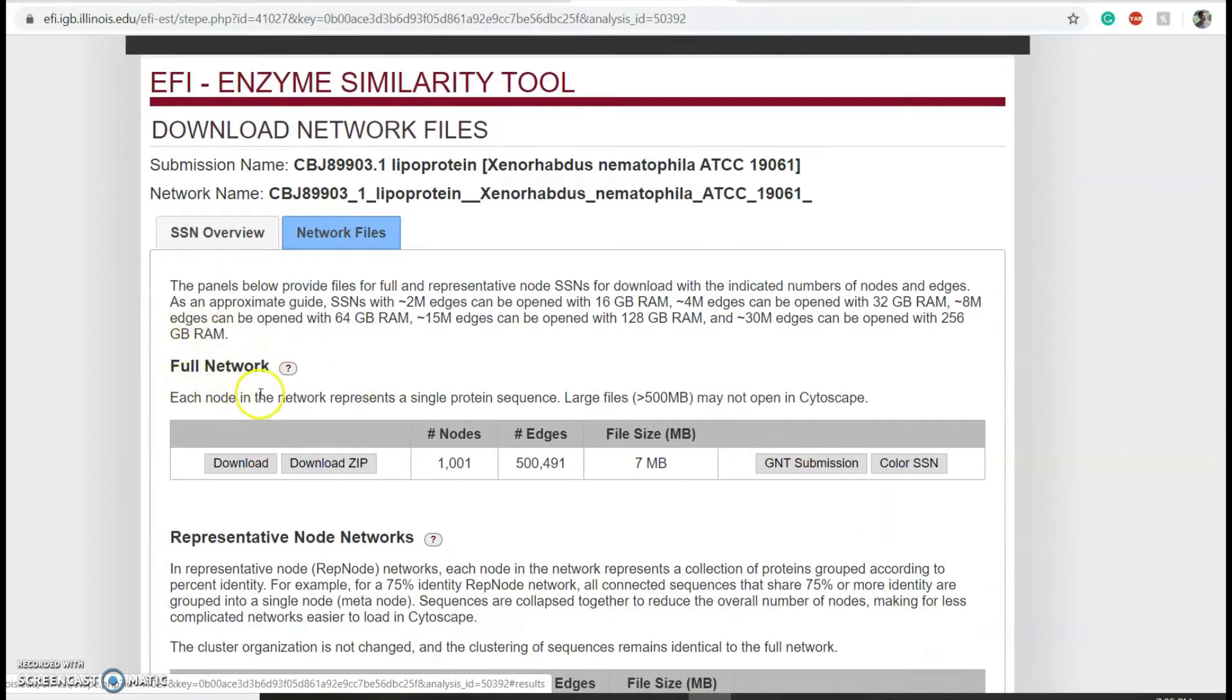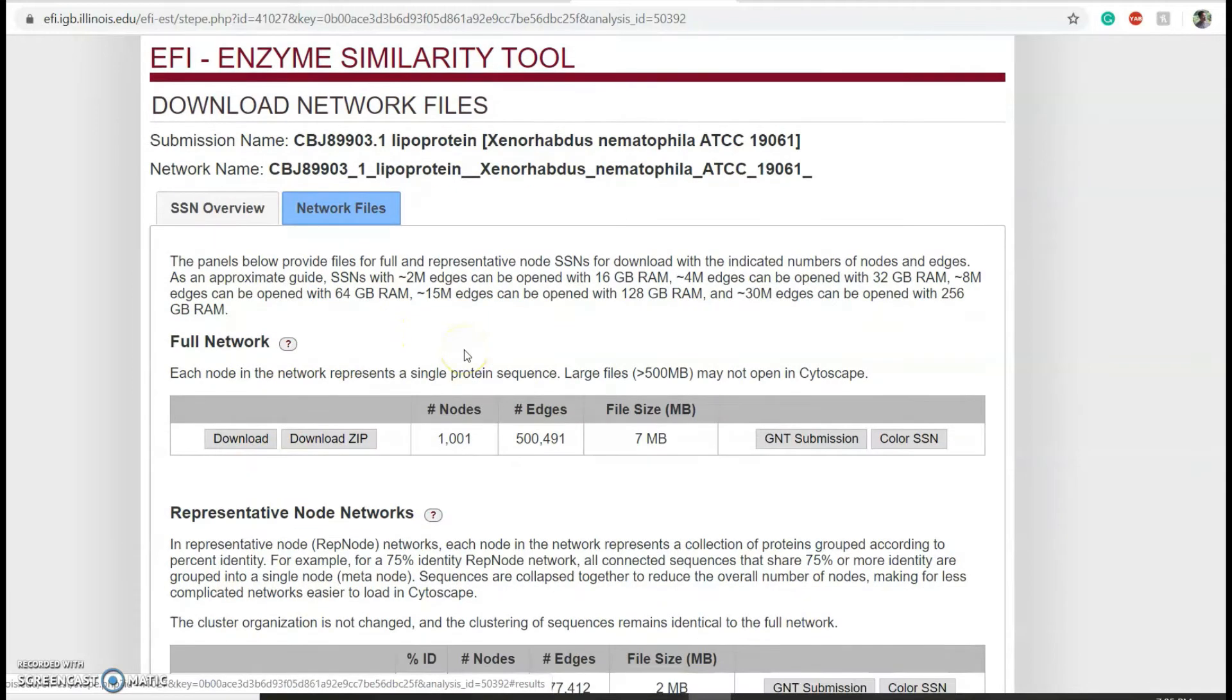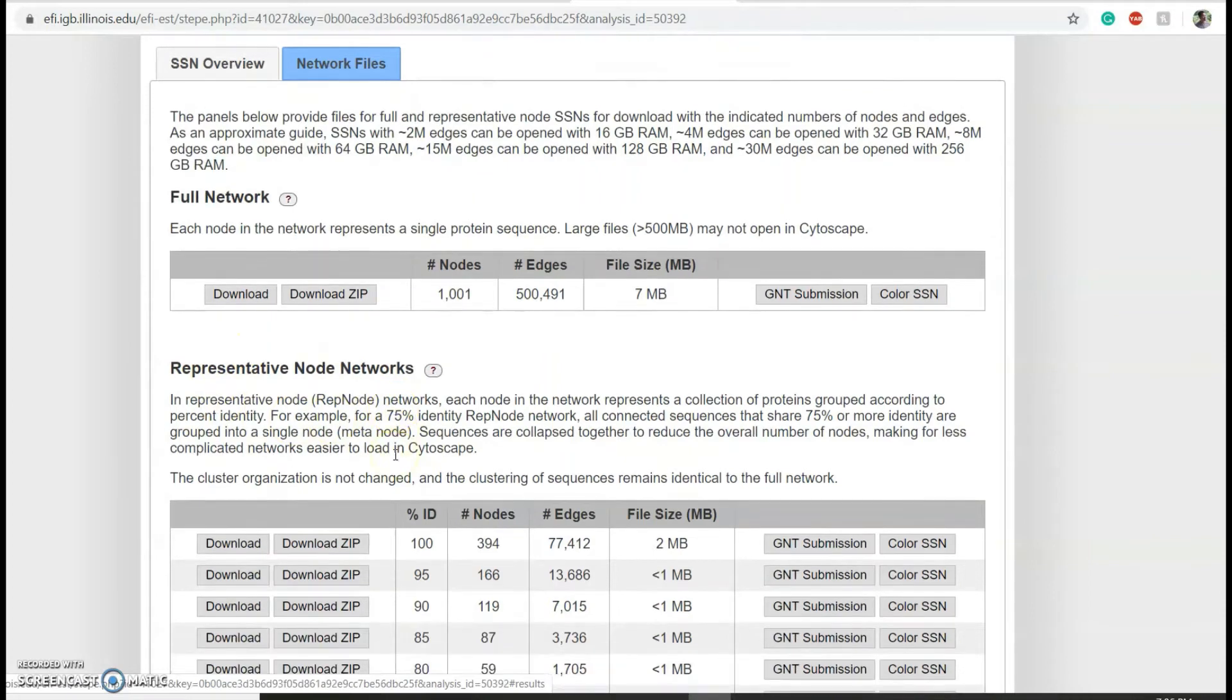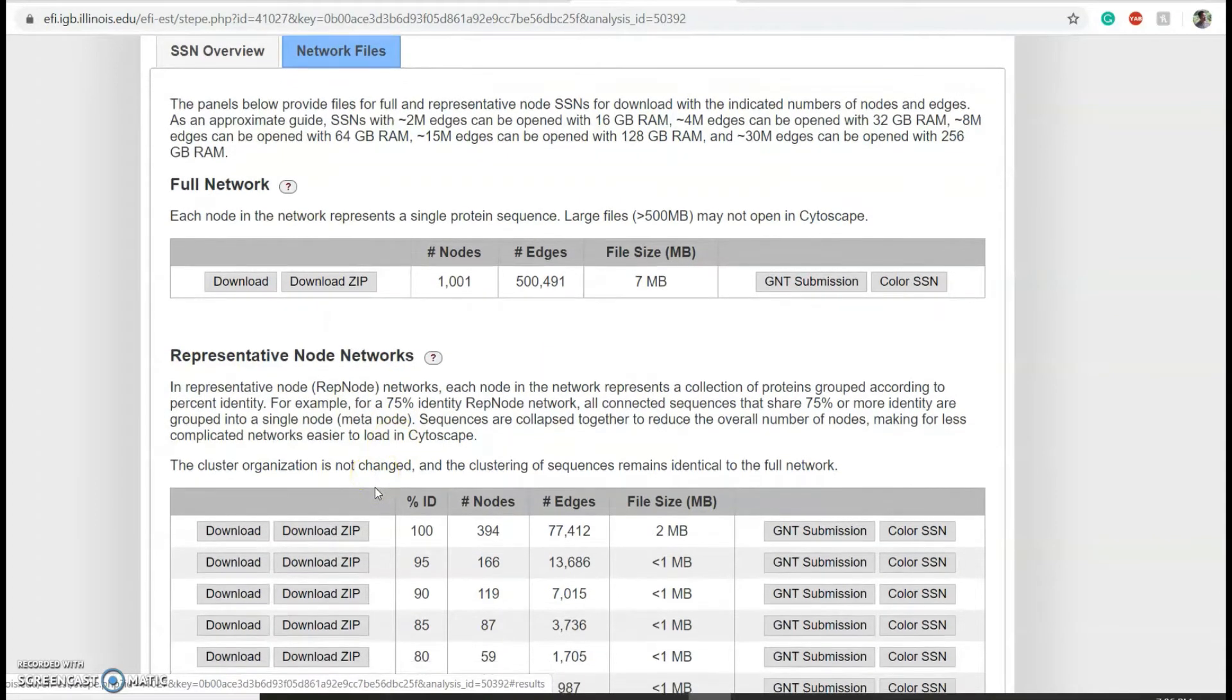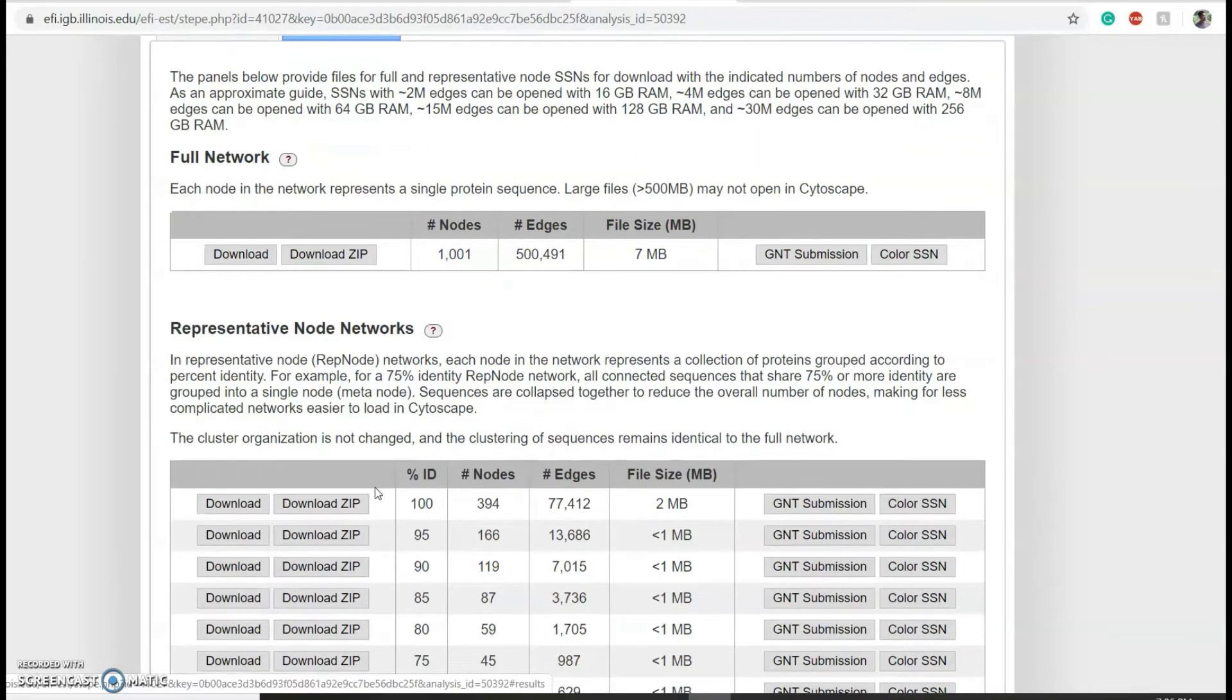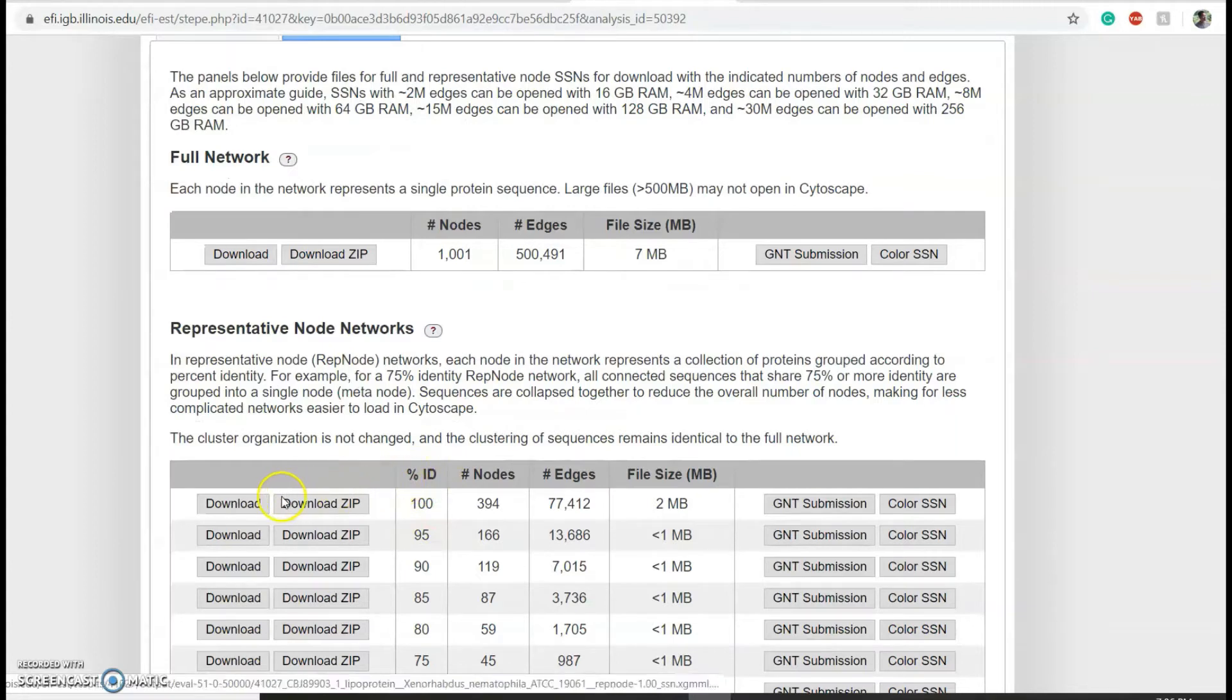By clicking on the network files, you will see a list of networks that you can download and visualize. For the full network, all protein sequences you retrieve will be represented separately. For initial analysis, I prefer working on a representative node network, specifically networks in which protein sequences that are 100% identical are represented together, which is this one. So I can download this network.